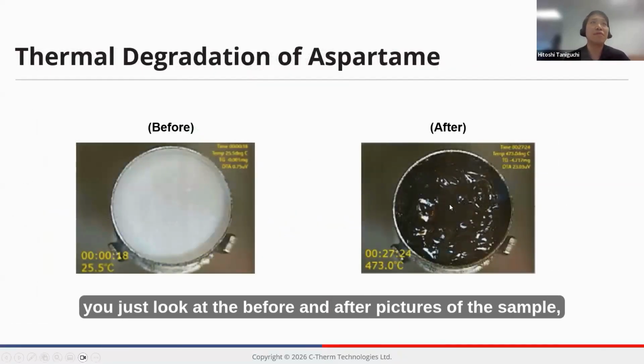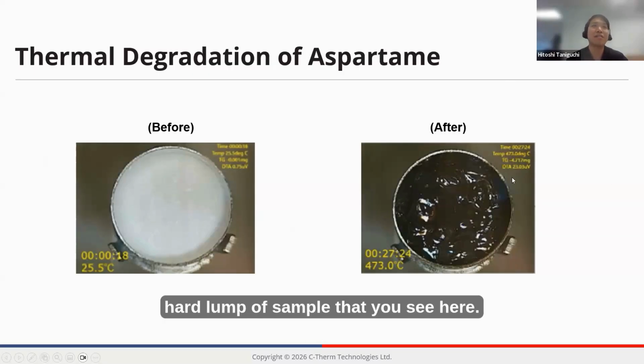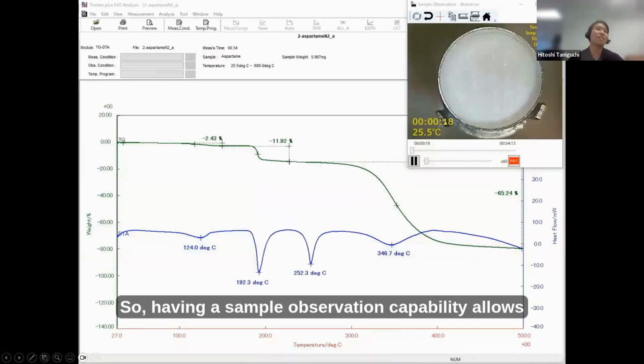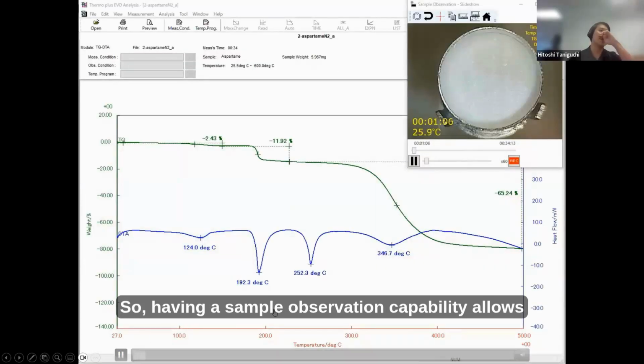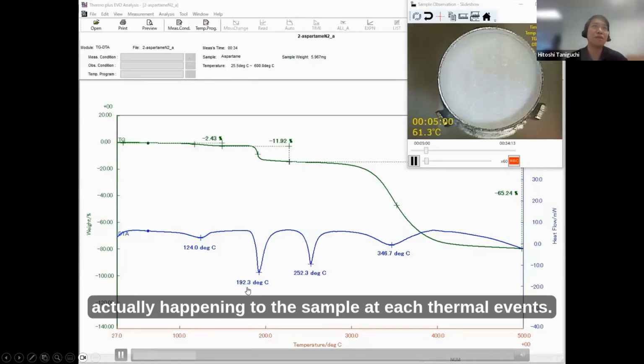even though you know the general gist that your sample might decompose somewhere around this temperature. And if you just look at the before and after pictures of the sample, it's really hard to discern when this white powder became this black tarred lump of sample that you see here. Having a sample observation capability allows you to see what's actually happening to the sample at each thermal event.